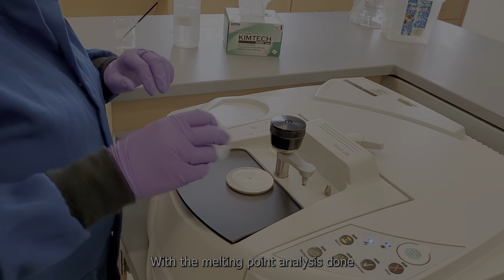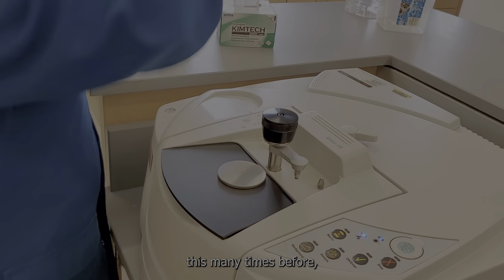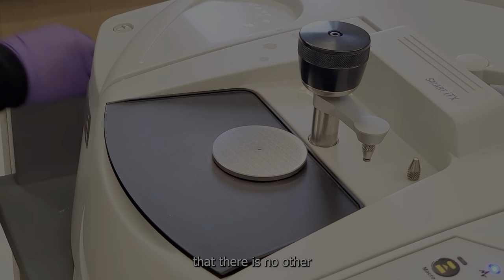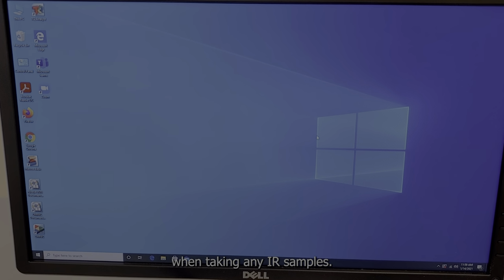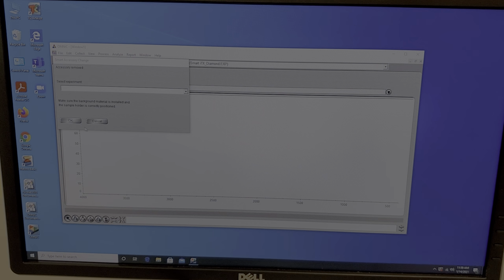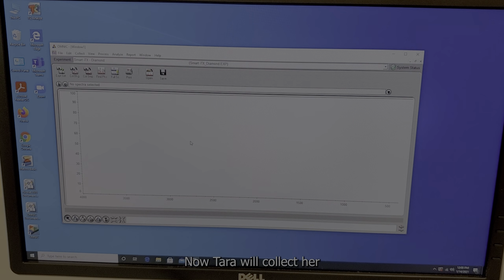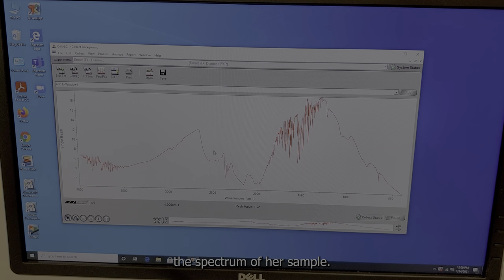With the melting point analysis done, now we can collect our IR. You guys have seen this many times before, but just a quick refresher, Tara is cleaning the pedestal and ensuring that there are no other contaminants on it. Please always do this when taking any IR samples. Now, Tara will collect her background spectrum first, and once that background is collected, she can then take the spectrum of her sample.